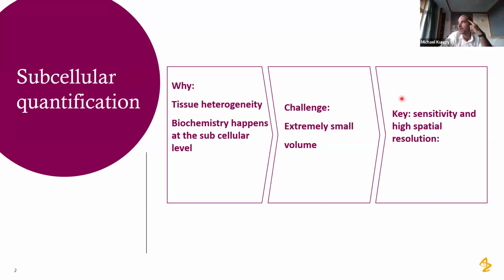So we look at labeled fragments because there's multiple fragments per molecule, and we can put multiple labels on. The upshot of this is that you really have to know a lot about your metabolite or your drug before you look for it. And hopefully there's a lot of information in that spatial distribution. That's kind of where we're at.